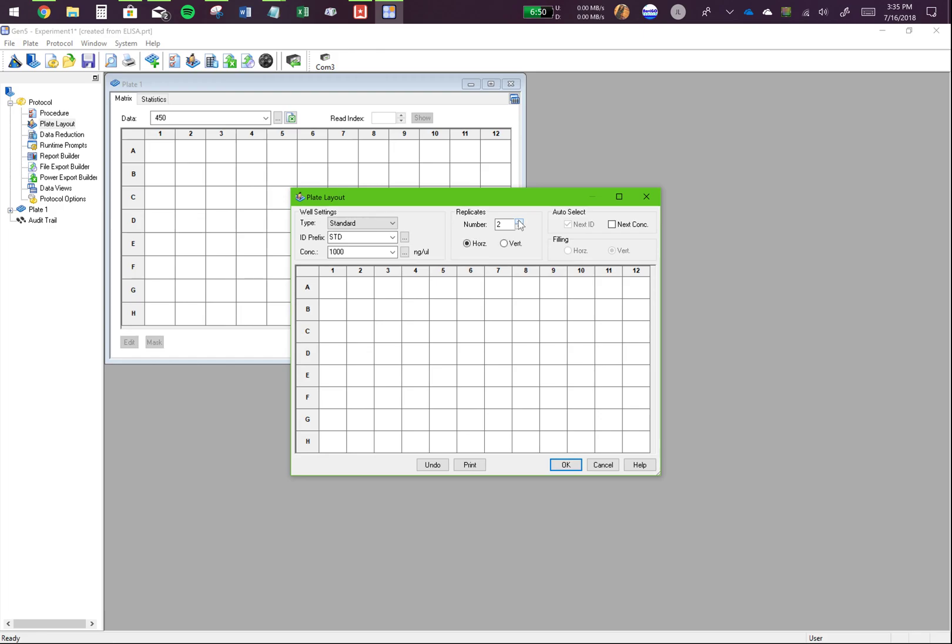You have your standard value here. You have the concentration. Let's make this in triplicate. Again, all this layout will depend on your actual plate. Right now, I'll just assume any random plate.